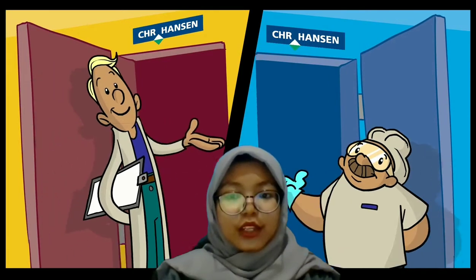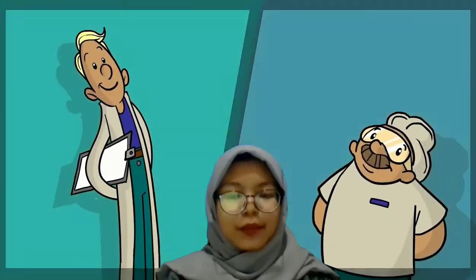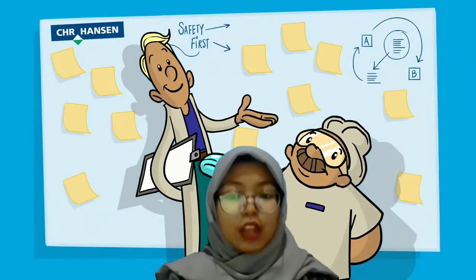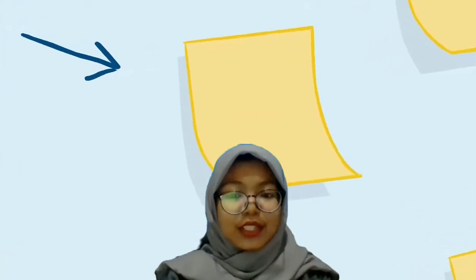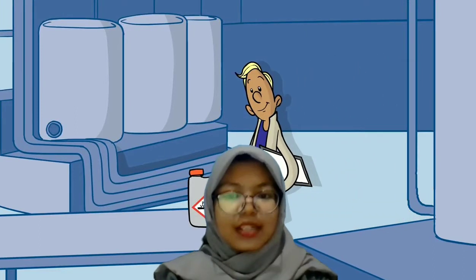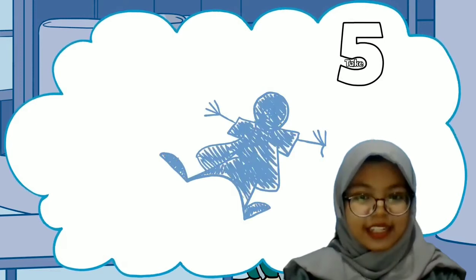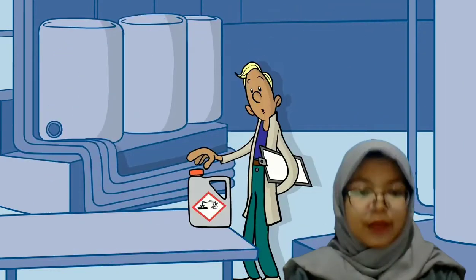Many of the chemicals we use in the lab are potentially dangerous, especially under high heat, pressure, or when they are mixed with other chemicals. There are two main tools that we use to identify chemical hazards: safety data sheets and chemical labels. Every chemical in the lab is required to have a technical document called a safety data sheet, or SDS, usually provided by the manufacturer.